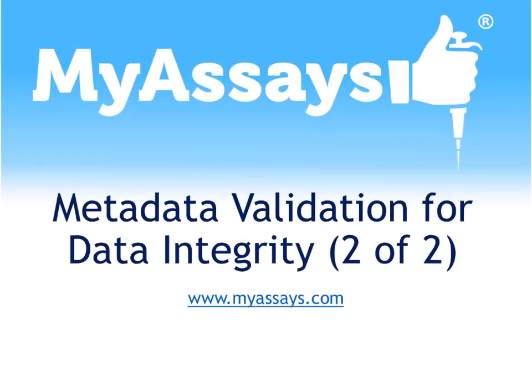In regulated environments, it's essential to verify that data used for analysis comes from an expected and approved source, and that it was generated using the correct measurement parameters. MyAssays Desktop supports this by allowing you to configure secured protocols that only accept data originating from defined sources, for example, a specific instrument running a specific measurement method.